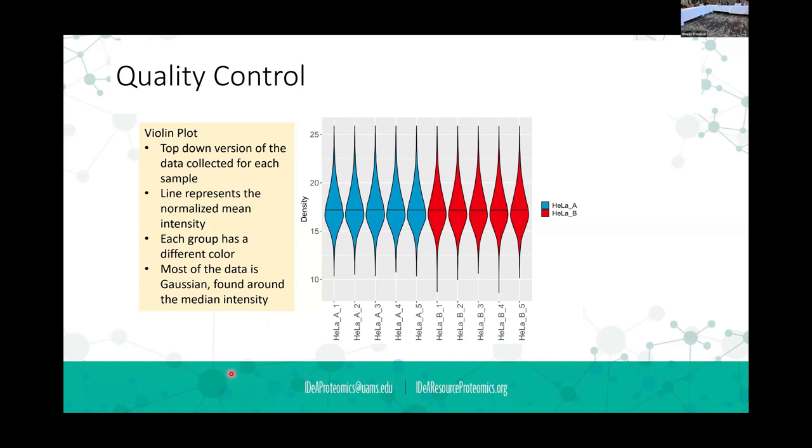We normalize, basically, if you're doing the pull down, we're hoping that you do a good job of normalizing the input. And in those cases, and we didn't get into this yesterday, but oftentimes we'll ask for a sample of the inputs, because sometimes the inputs are different, and you may not realize.